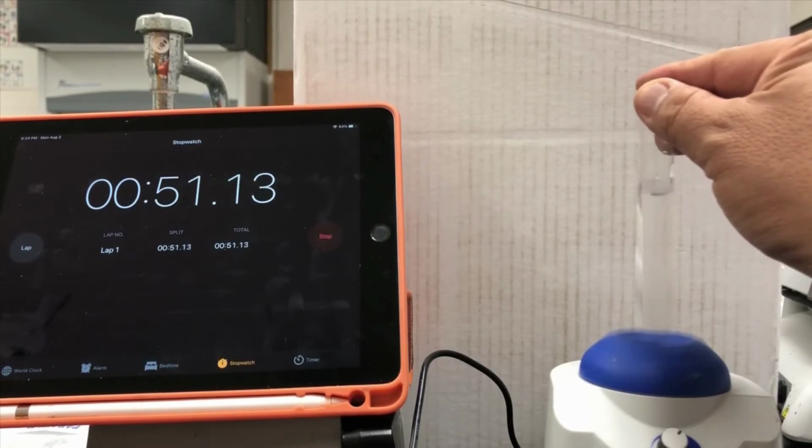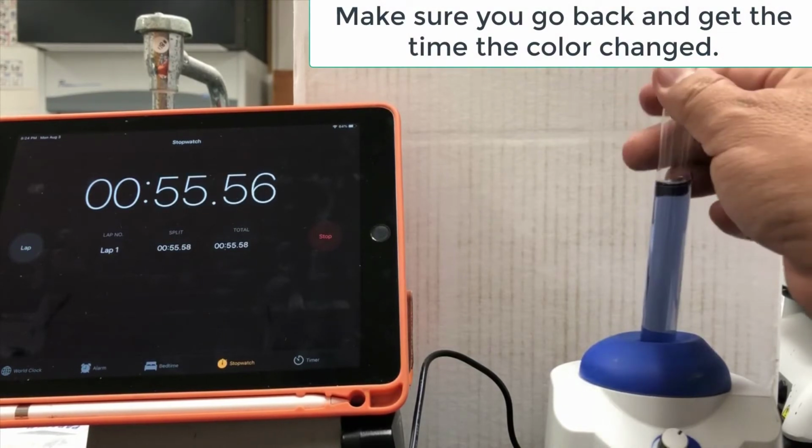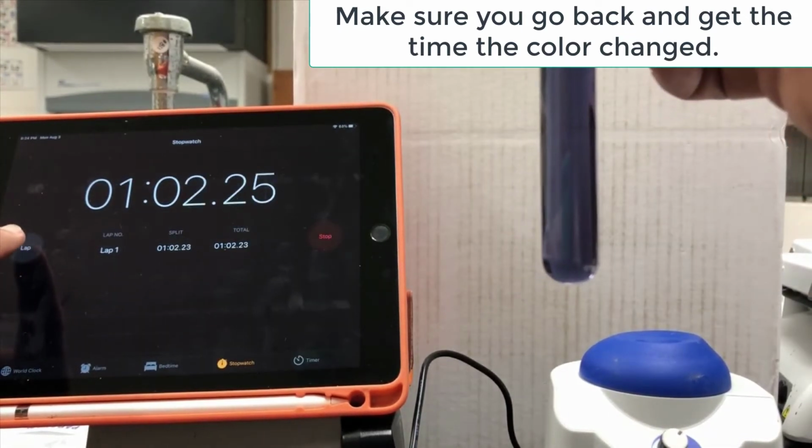Right, you can see color. Yeah, so go back to when the color first appeared and then record that time for trial 1 of experiment 2.